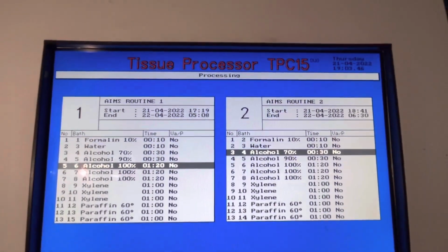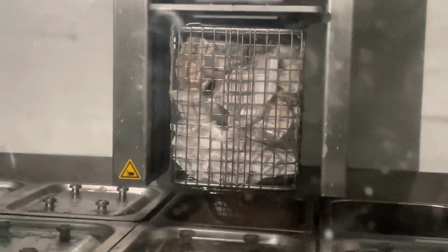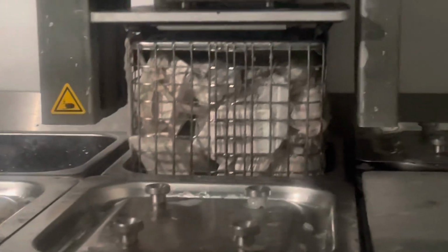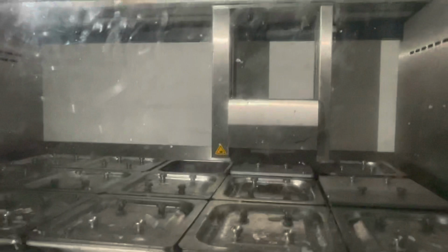The actual tissue processing is an overnight process which has 3 main steps: dehydration, in which the most commonly used substances are alcohol and acetone as they are cheaper. Ethyl alcohol is preferably used. Next is clearing, which is basically de-alcoholization. The commonly used substances are xylene and chloroform. Then comes impregnation, in which the tissue is transferred to a container containing molten paraffin wax.